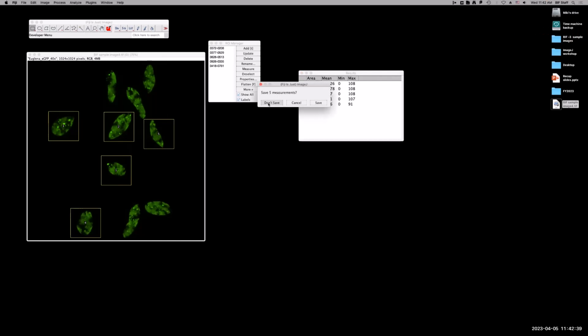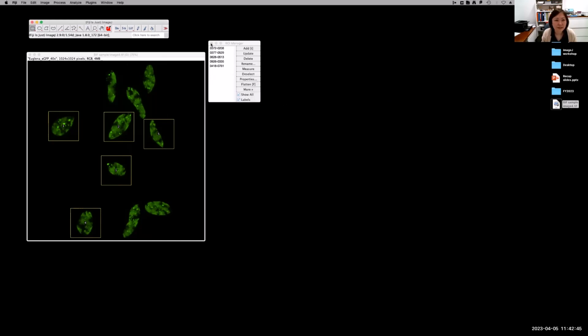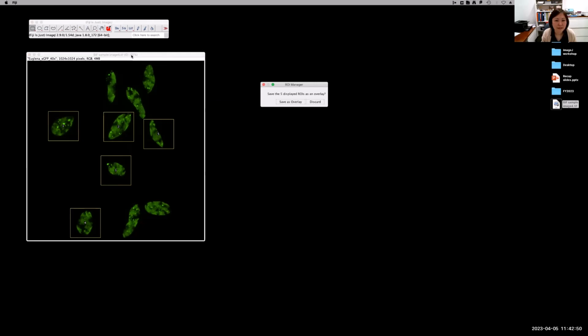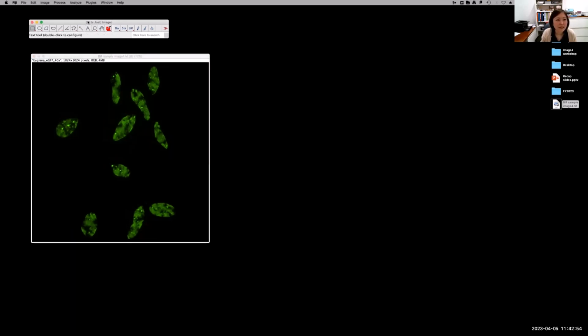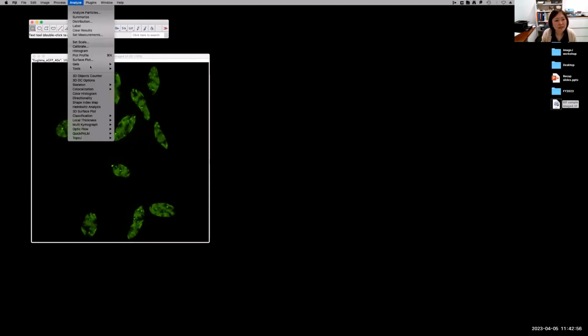Hi, Nikki. Can you show again how to open ROI? Oh, yeah. Go to Analyze, Tools, and ROI Manager.